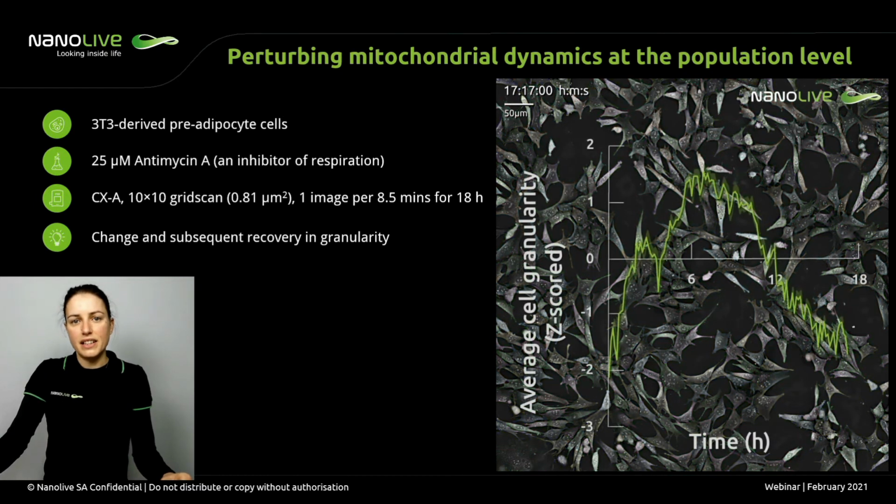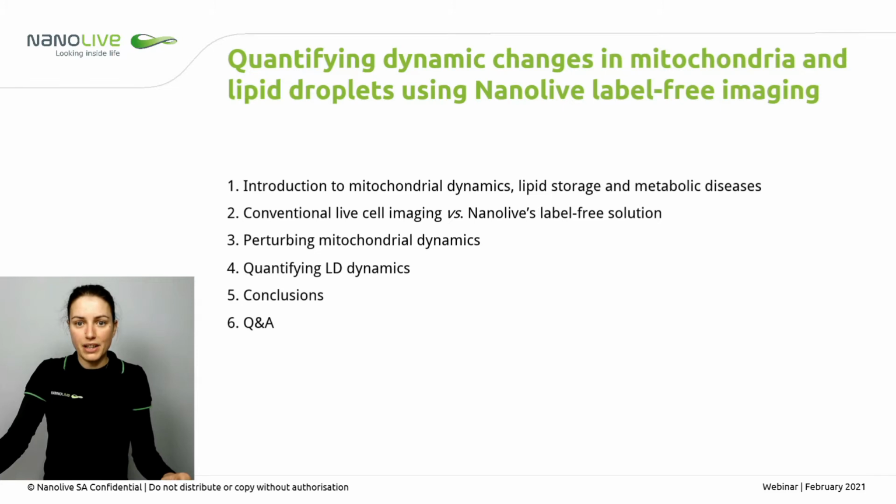So understanding the link between cell health and granularity requires further investigation, but looks like it could be a very promising avenue for research in the future. Now let's move on to part 2 of the webinar, lipid droplet analyses.